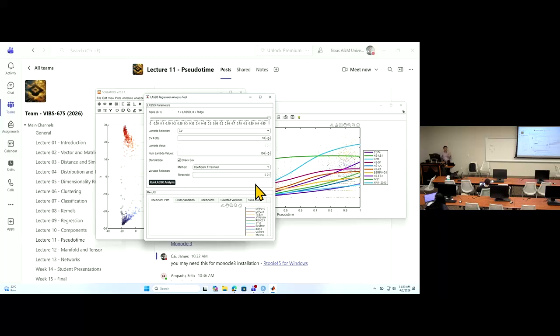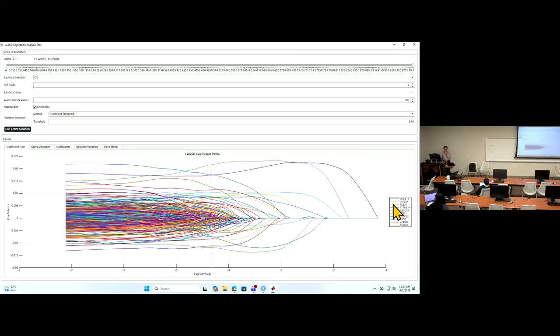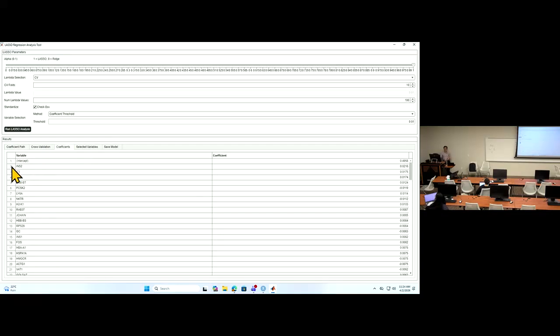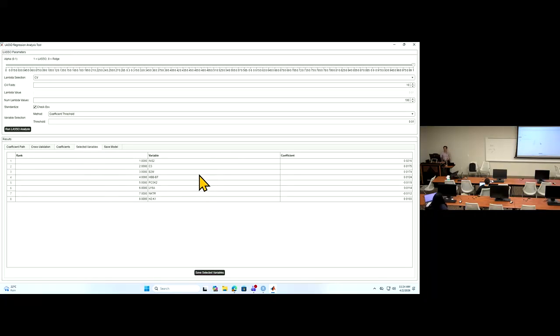Okay, this will give you a table. So which gene combinations will give you the best results? It helps you to find the top genes when they are combined to give you an explanation for the time. You probably need to revisit Lasso, one of the lectures we had on regression and regularization, and how you interpret these results. But you do have a list of genes, with coefficients. Those genes explain the time, the selected top ones.